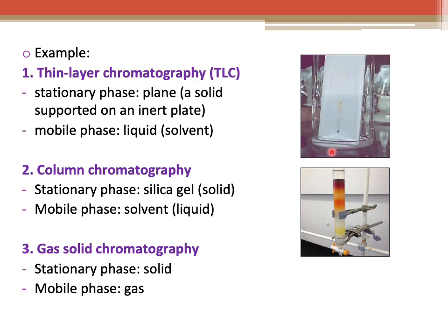Okay, kita ada satu plate. Dekat permukaan plate ni ada apa? Ada molekul lah, ada something, ada solid yang kita attach pada permukaan plate tu. Yang itu adalah solid. Okay. And mobile phase should be the liquid solvent. So this one we call it thin layer chromatography.